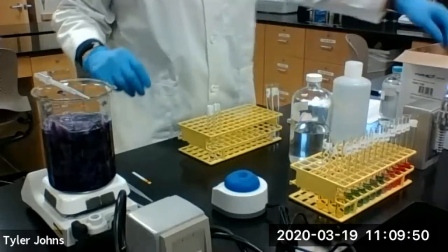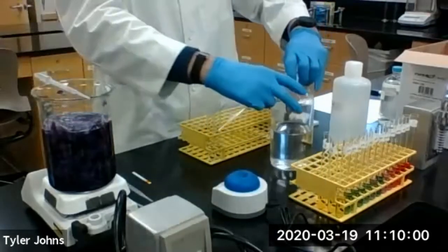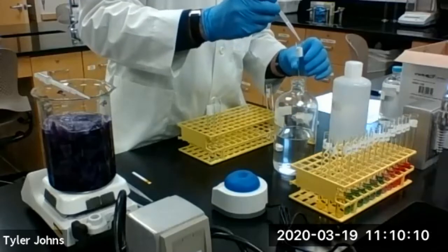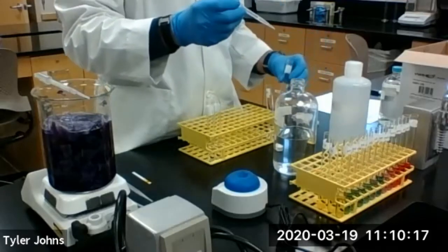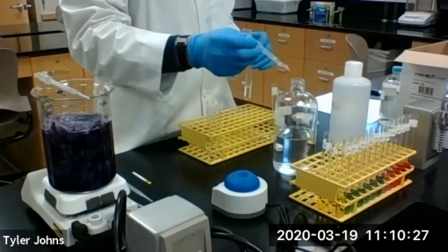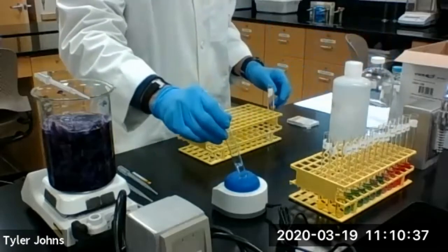Okay, now let's add the 5 drops of 0.1 molar hydrochloric acid. So again, we have the 0.1 molar hydrochloric acid. We'll add 5 drops to our deionized water, and we'll add 5 drops to our pH 7 buffer. We'll mix these solutions.